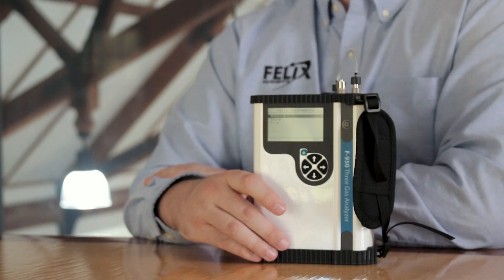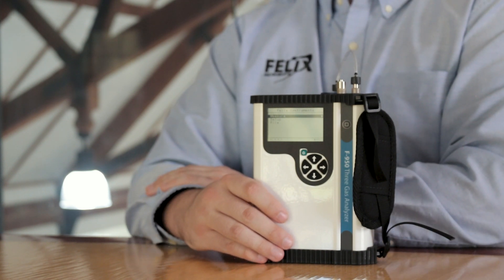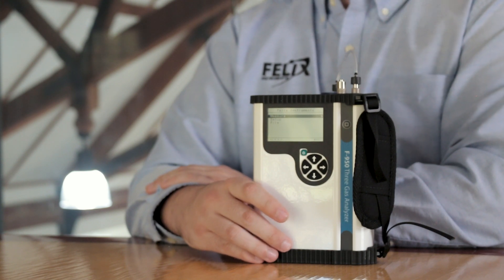The F950 is being utilized as a tool to monitor ethylene during transport, for management of controlled atmosphere storage facilities, for verification of ethylene mitigation systems, in packing house inspection and precision citrus degreening, in storage assignment and distribution centers, and as a tool for assessing quality of modified atmosphere packaging and packaging efficacy.